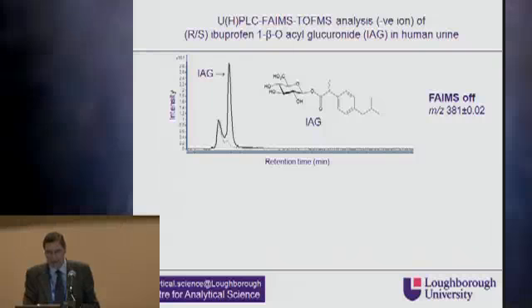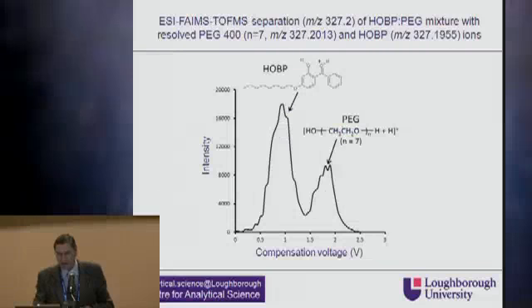Okay, let's take the next question, please. With respect to this slide on the dimethylamine, you had indicated thermal desorption ESI. It seems to me that was like a chemical ionization. Can you explain that? Okay, this is what you might call the extractive electrospray technique introduced by Renato Zenobi. You can look at his analytical chemistry papers on that.